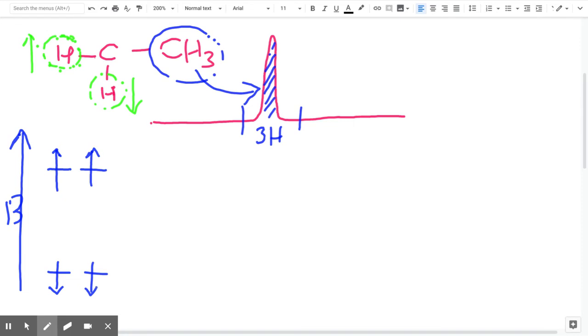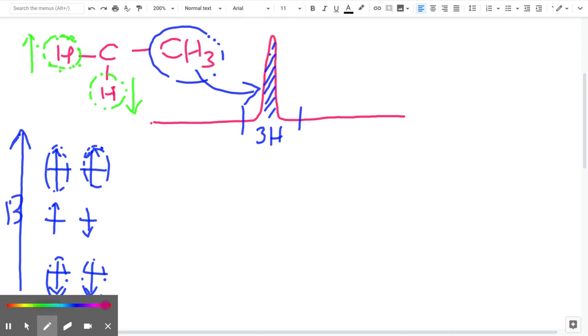So thinking about the numbers, we've got two upward integrals, and that is going to be different to two downward integrals. Likewise, that is going to be different to if we had one of each. Essentially, the energy of this middle one would be the average of the magnetic field B, because we've got an equal contribution from an up proton minus the contribution from the down proton.